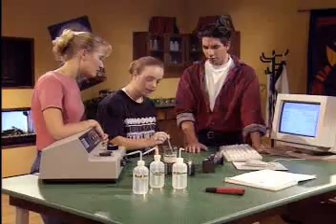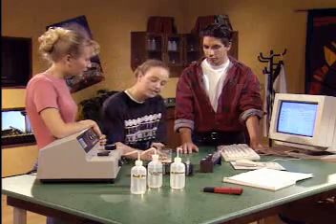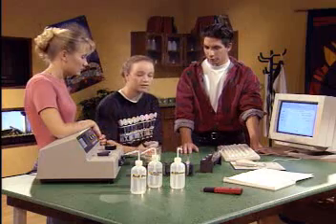What are you doing, Vanessa? I'm looking at the results of a lab that I did. I'm looking to see the effects of environmental conditions on population growth. So, what did you do? Well, I used yeast cells in different environmental conditions.